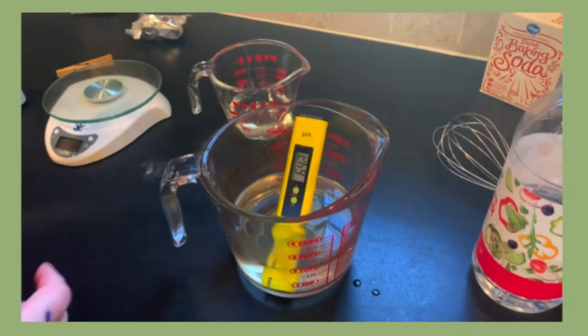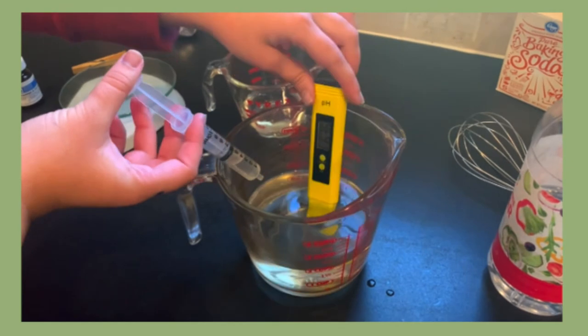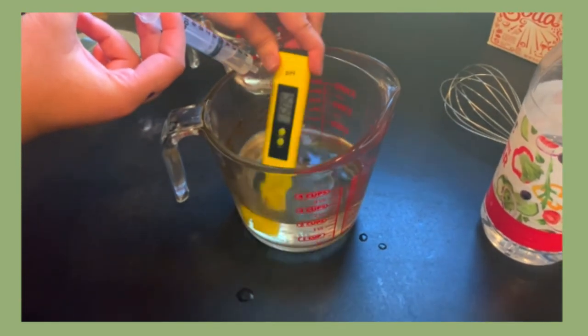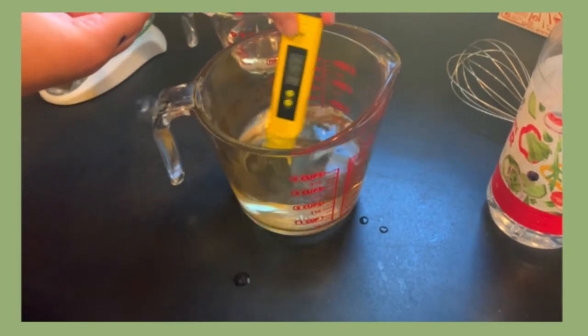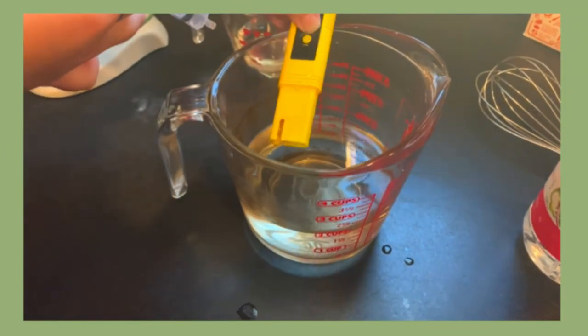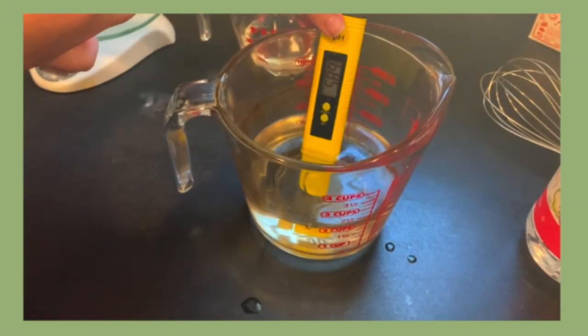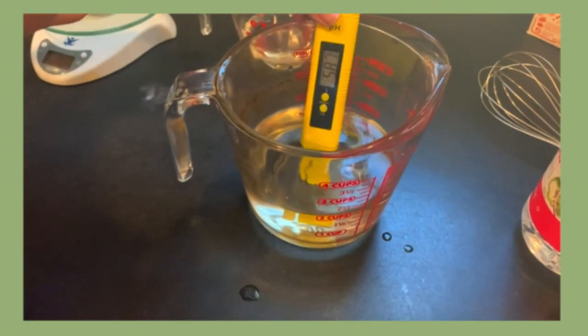Using the digital pH meter, adjust the pH until 5.8 is reached. If the pH is too high, add vinegar with a syringe a few drops at a time as is seen here. If the pH is too low, add baking soda a small pinch at a time. Continue to mix the solution as the pH is adjusted to make sure the vinegar or baking soda is fully incorporated.